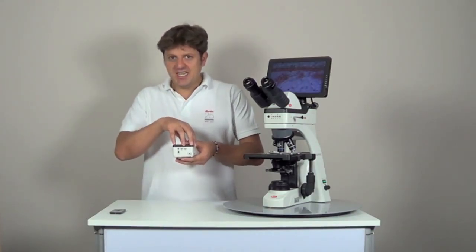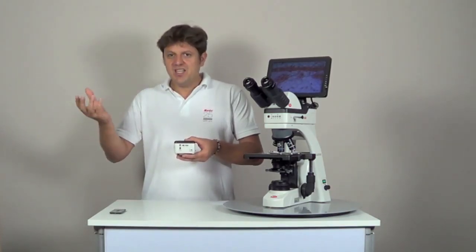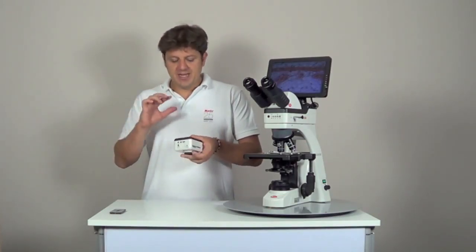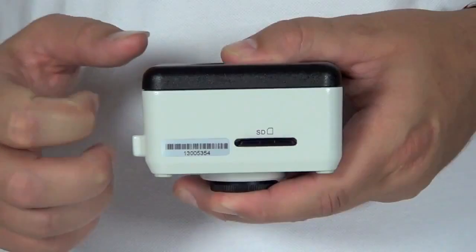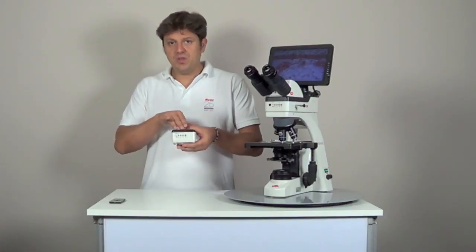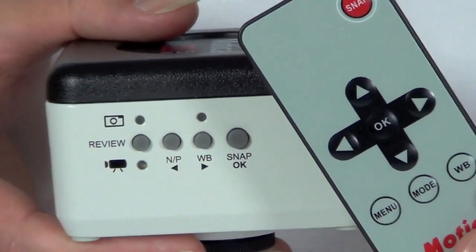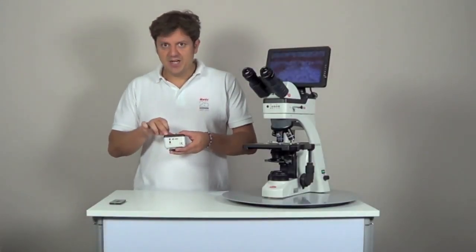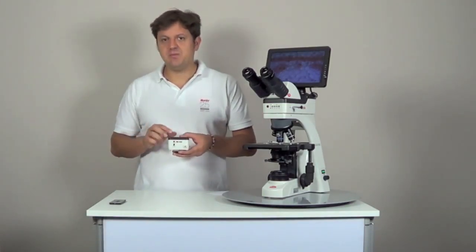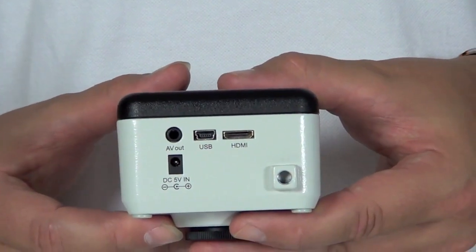It is a really fast live image of 30 frames per second and a resolution of 1080 lines. The image processing is done inside the camera, so no computer is needed, and this makes it ideal for educational laboratories that don't want to have the hassle with a computer every time they use their microscope. You can capture images of 5 megapixels, record videos, and store them on the SD card. The camera is controlled with the operation buttons on the side of the camera, or with the remote control. The Maticam 580 also has an analog output to connect it to analog monitors, however this technology is getting outdated and HDMI is becoming the new standard. There is also a USB connection to connect it to a computer, just like standard Maticams.